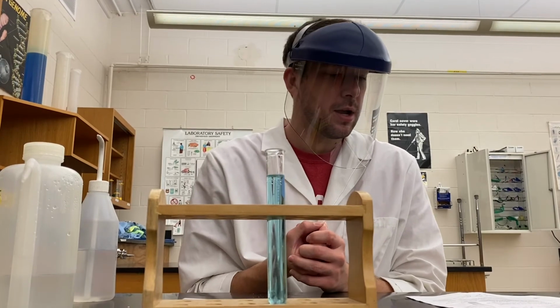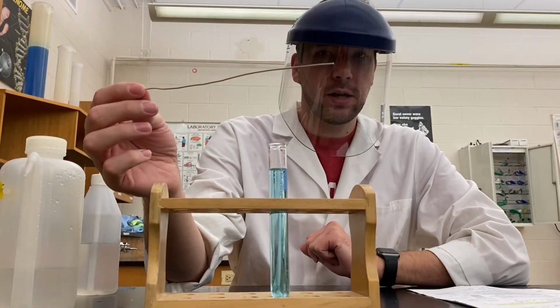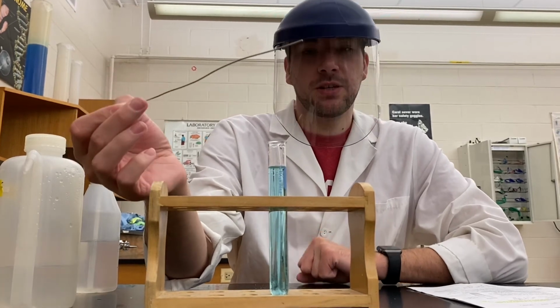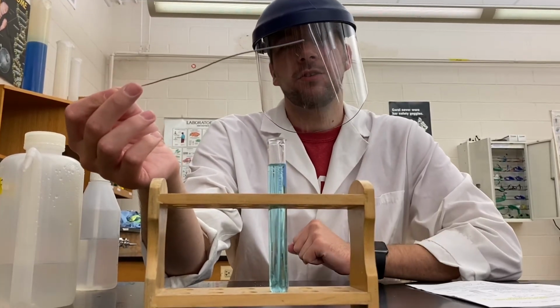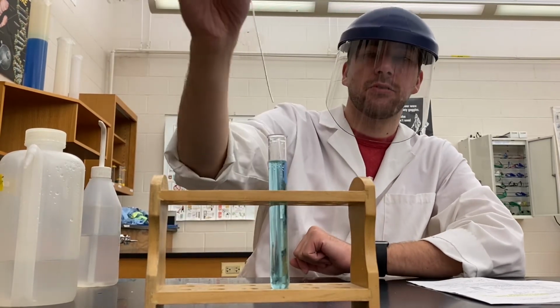For the next portion of the experiment, we are going to take a strip of aluminum wire and add that into the test tube. And again, we'll continue to make observations of the chemical change for our next reaction.